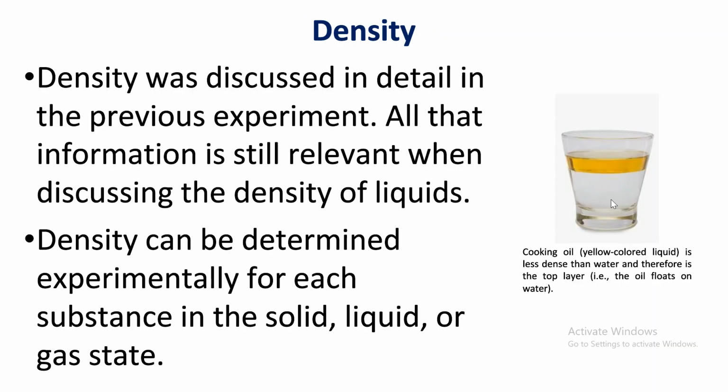If you remember, we defined density to be mass divided by volume. And density can be determined experimentally, again, by measuring the mass and volume, not only for solids, but we can also do it for liquids and gases. Density is so important because it allows us to identify the physical properties of specific substances.